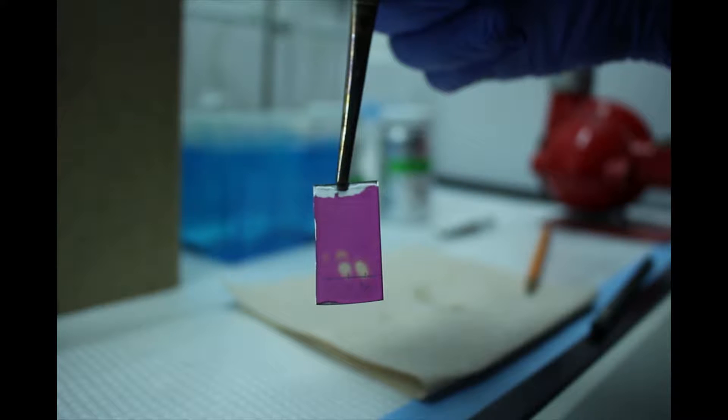The more non-polar a compound is, the more it will interact with the mobile phase and the further it will travel up the TLC plate.